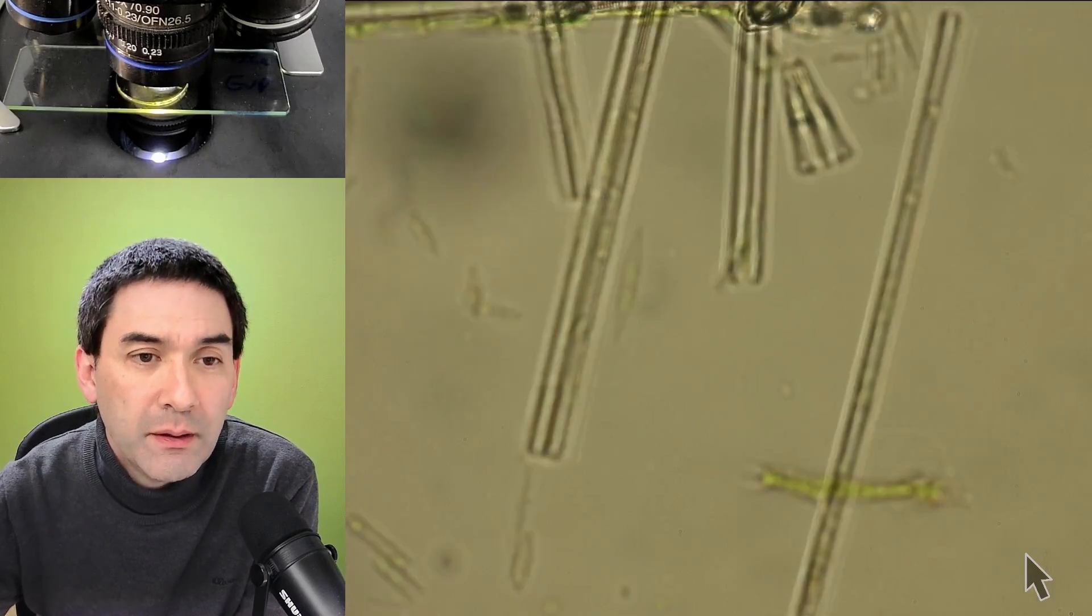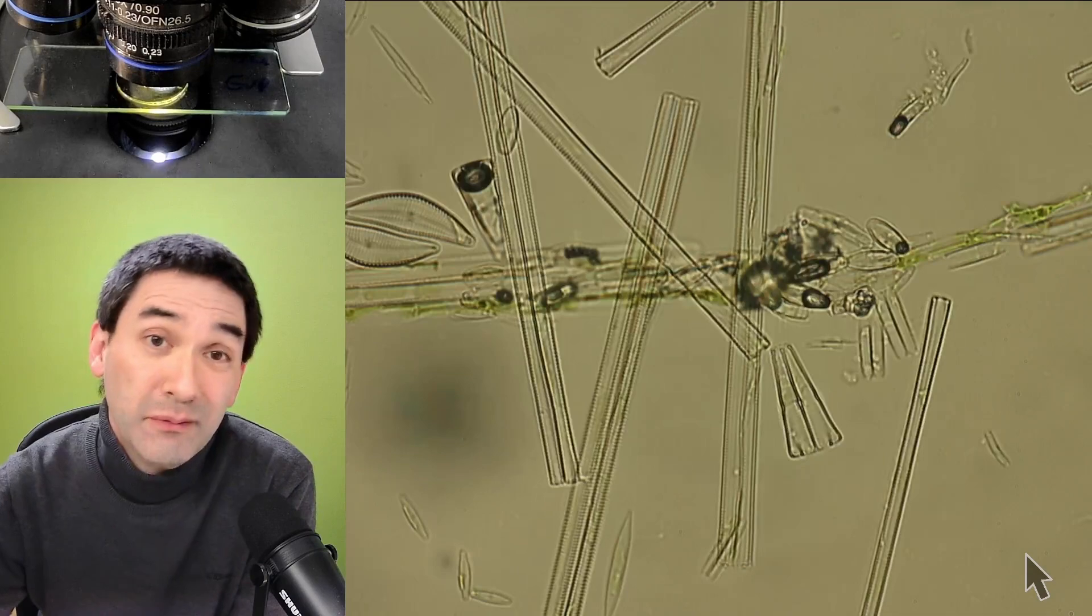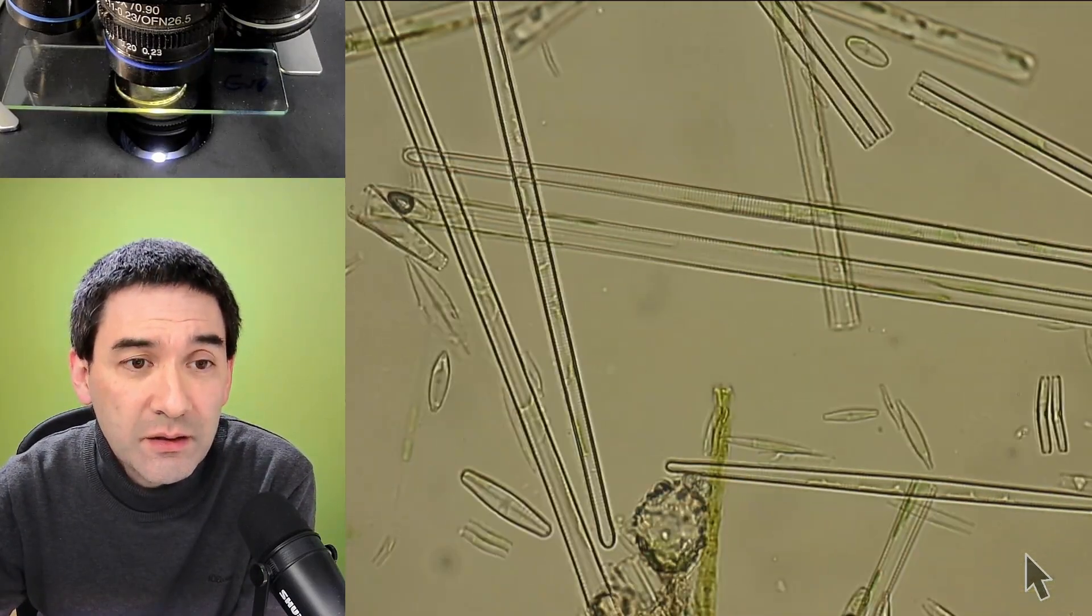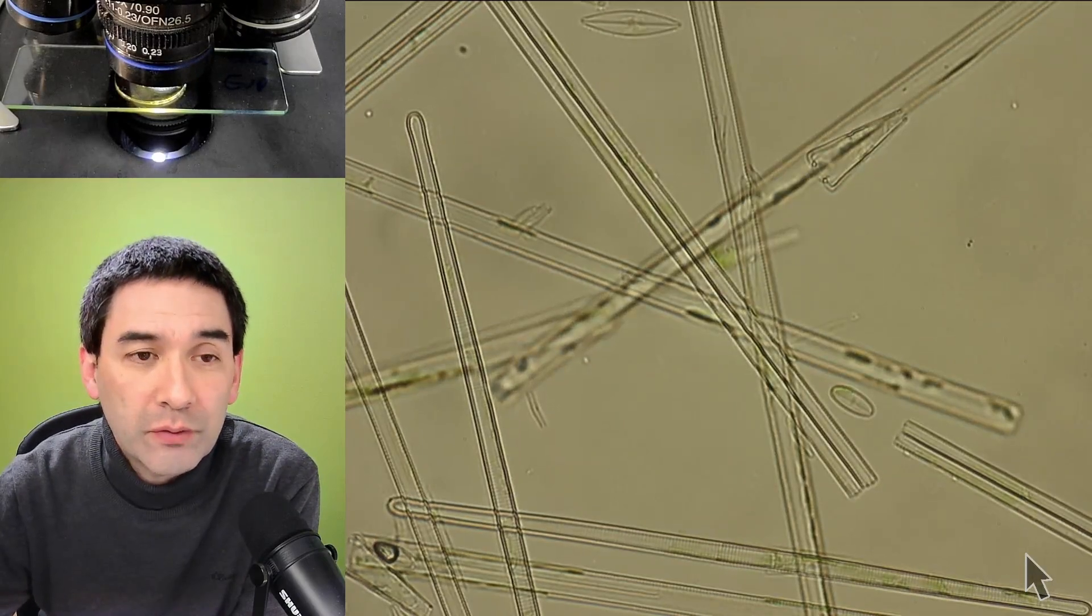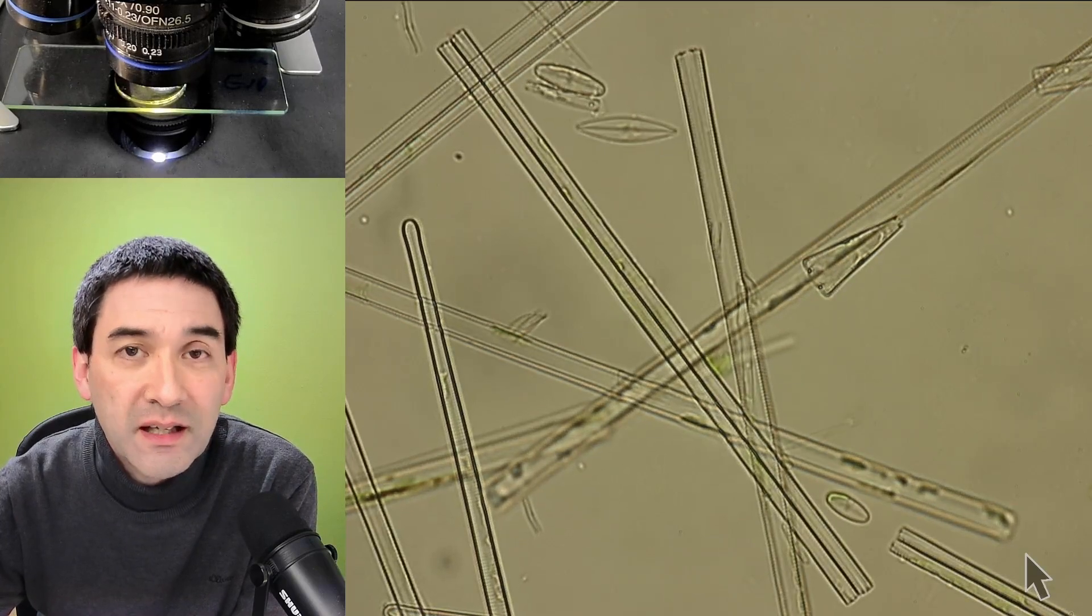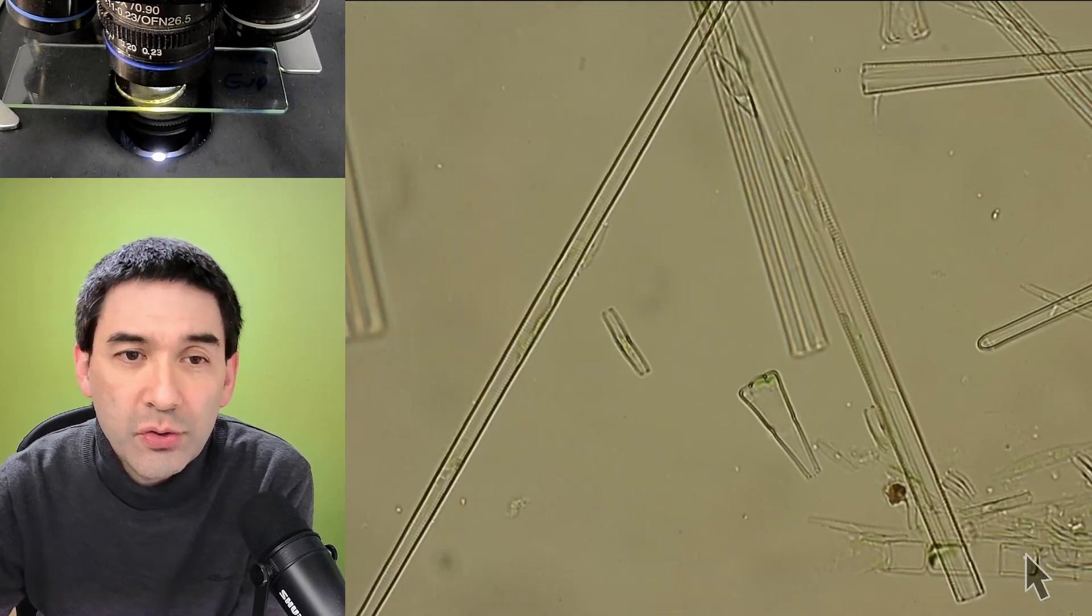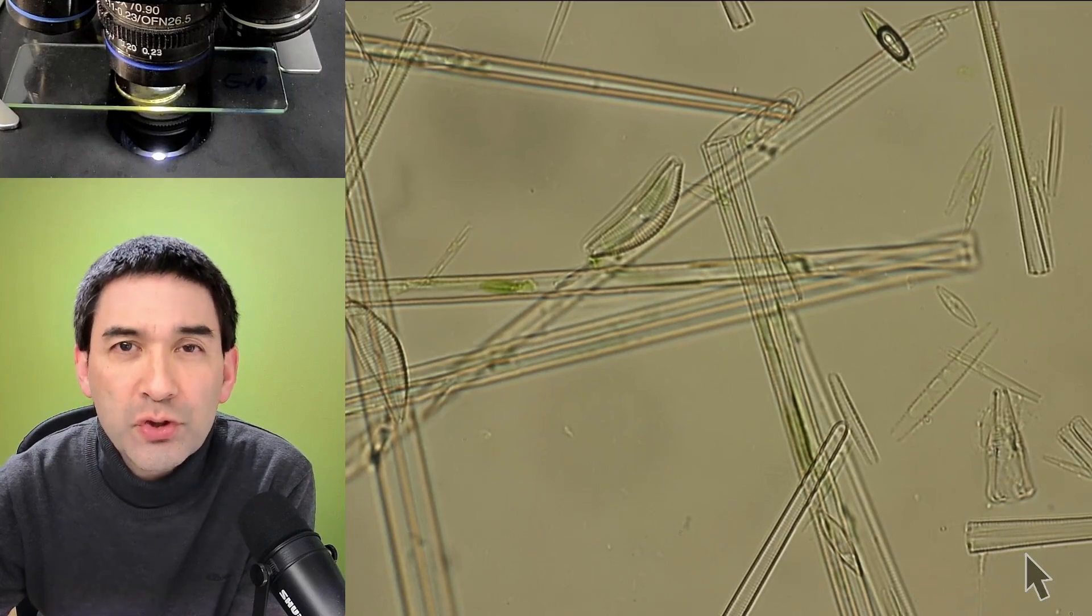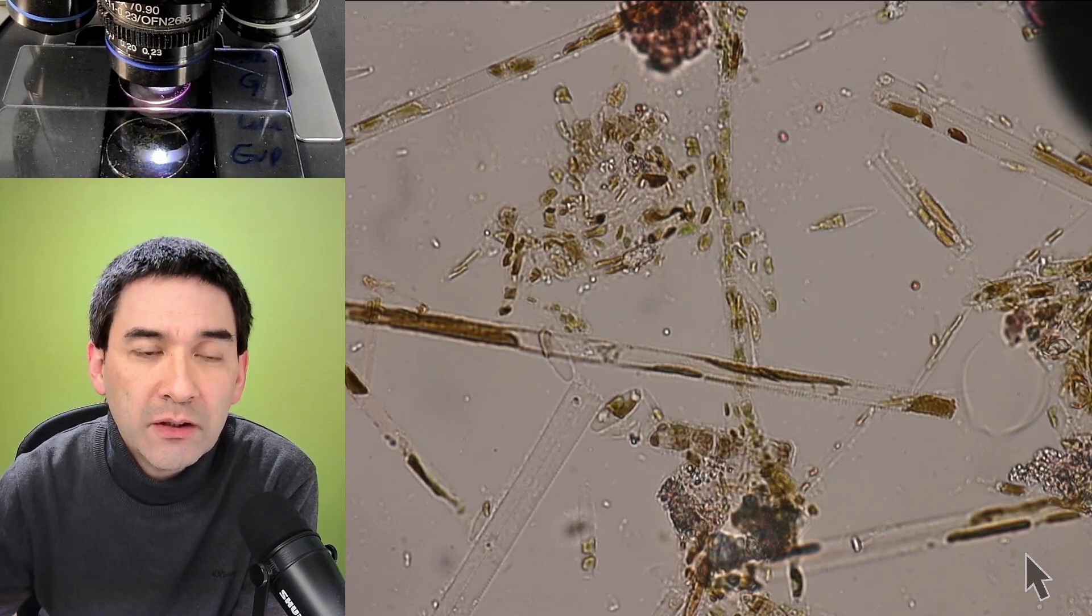The mounting medium therefore has a direct, chemical impact on the specimen. For this reason, the choice of the mounting medium is very critical because it really depends on what you want to show. If you are okay with the fact that the cells lose their color because it dissolves, well then fine, and you use Eupro. But actually, normally you don't want this to happen—you want to preserve the natural original state, and then you have to use a mounting medium that's based on water. Glycerin gelatin is one of those mounting media that is essentially water-based.